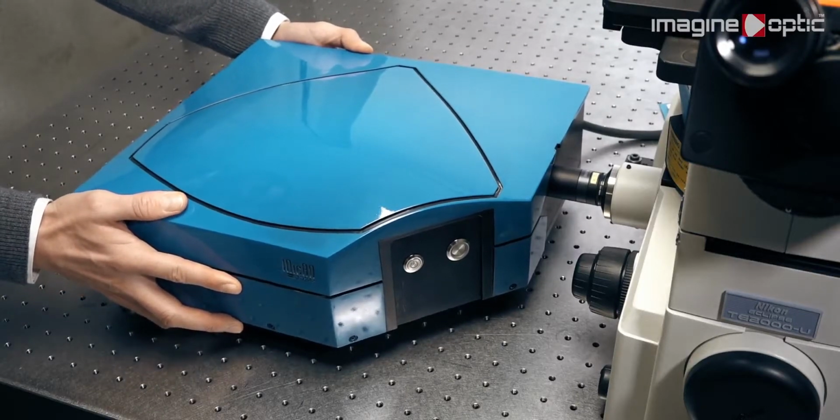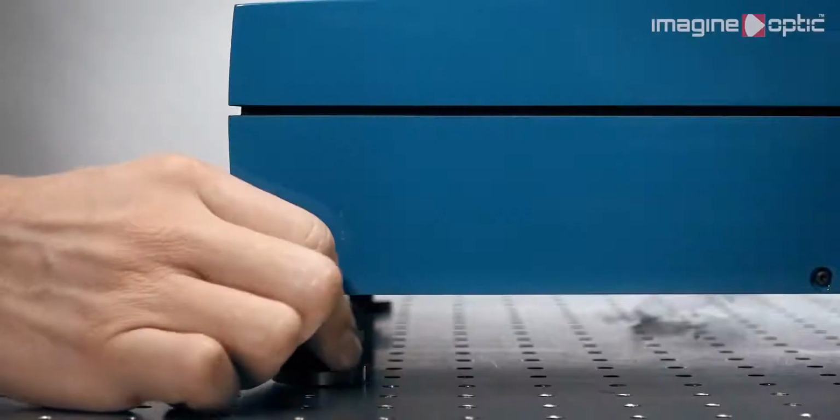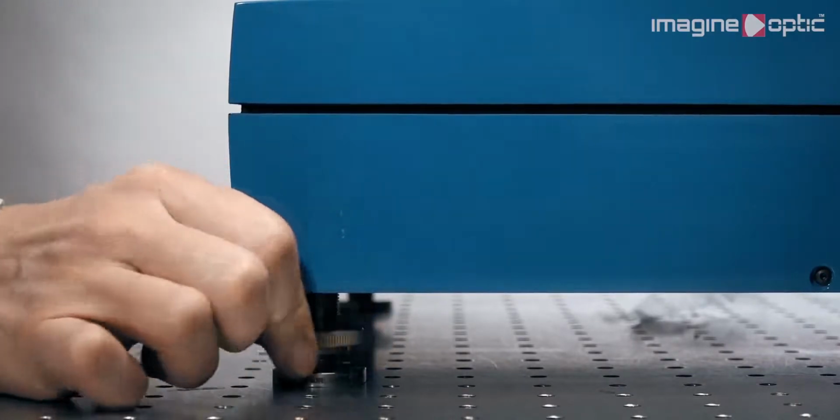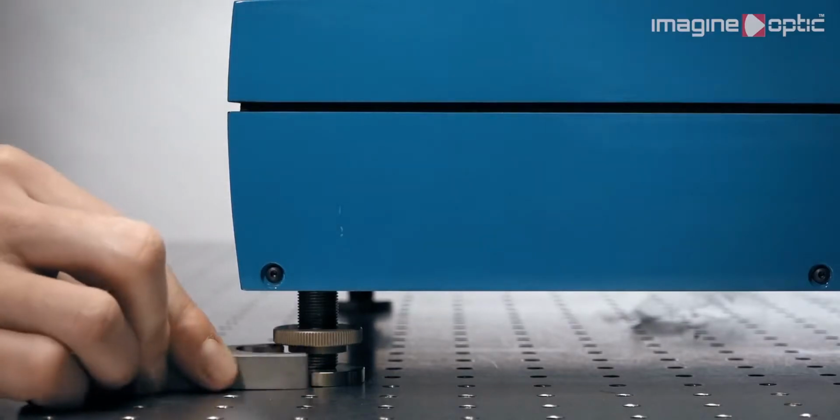The first step is to align it with a microscope. It is possible to adjust the height using the feet of the MicAO unit and adjust the horizontal tilt by playing with the lateral position of MicAO. Once the optimal position is found, the MicAO device is firmly fixed to the optical bench using clamps.